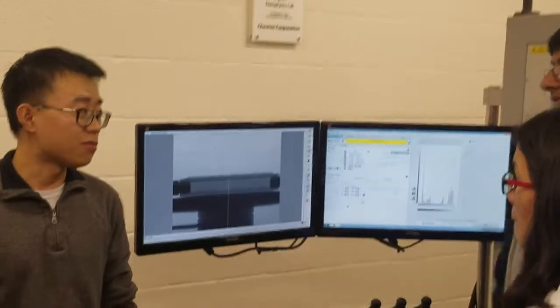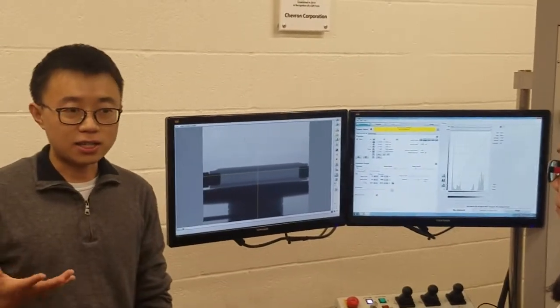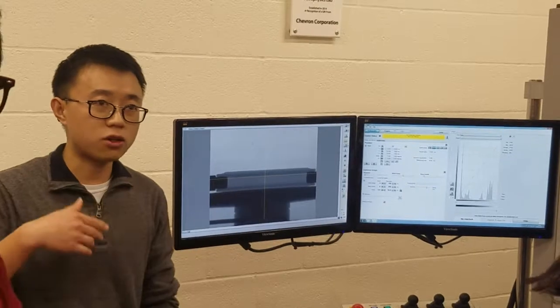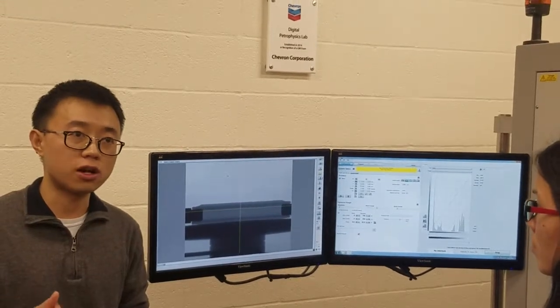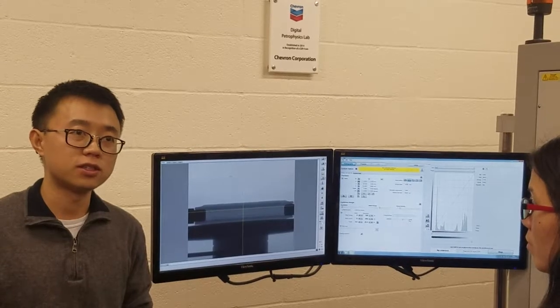Can we do fluid experiments inside this scanner? Right now, you can only design a lab-made flow apparatus, like what Jasper did, because we cannot run lines through the scanner. So you have to have a remote control pump to inject fluid inside your sample.